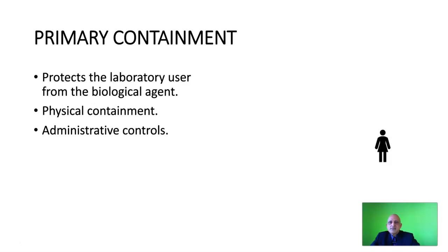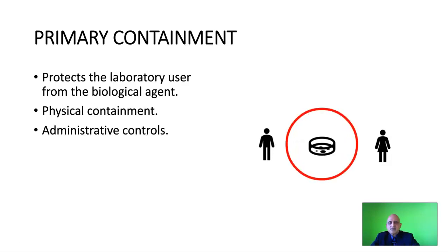Primary containment refers to controls which protect the laboratory user from the biological agent. These can be in the form of physical containment such as masks, gloves, and aprons, or in the form of administrative controls such as standard operating procedures. When laboratory users interact with a biological agent — such as a bacterium growing in a petri dish — primary containment protects them through administrative controls, engineering controls such as an appropriate biological safety cabinet, or personal protective equipment such as gloves and masks.